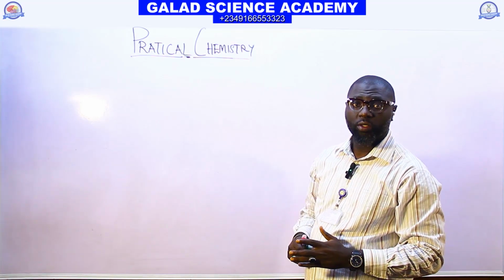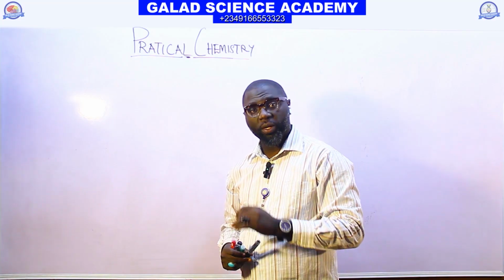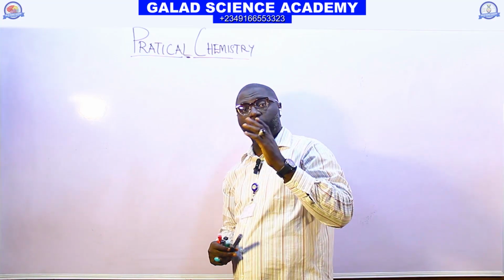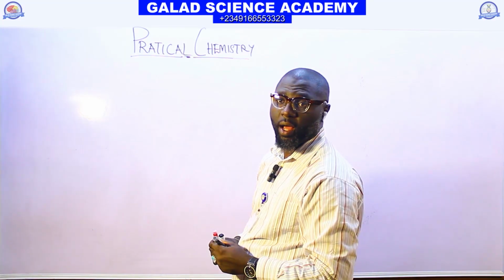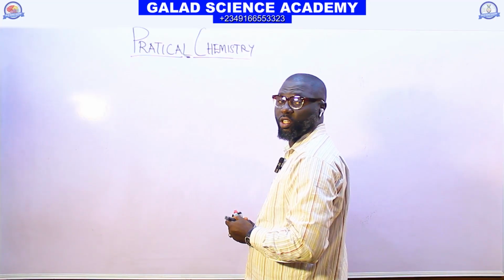Let us treat the second type of volumetric analysis, the second type of titration.